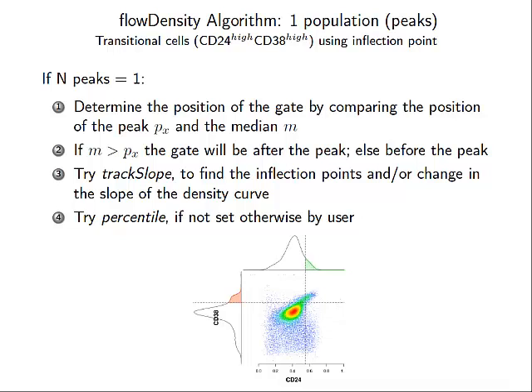Or you have an FMO control. That's the first time I've been waiting for that word to come up. And by God, I wish people ran FMO controls.